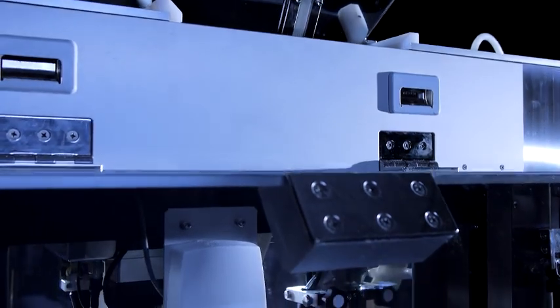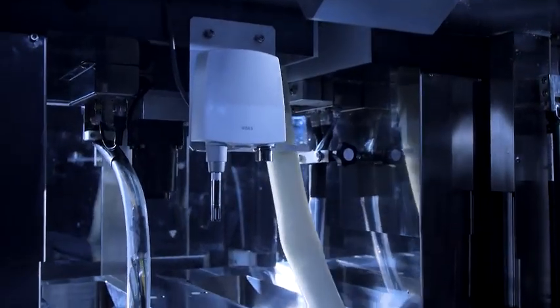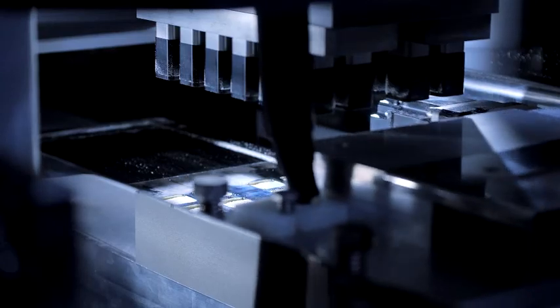QualiCaps has developed a high-performance tableting machine based on extensive accumulated knowledge in the pharmaceutical equipment business, for the single purpose of boosting the user-friendliness of your products.